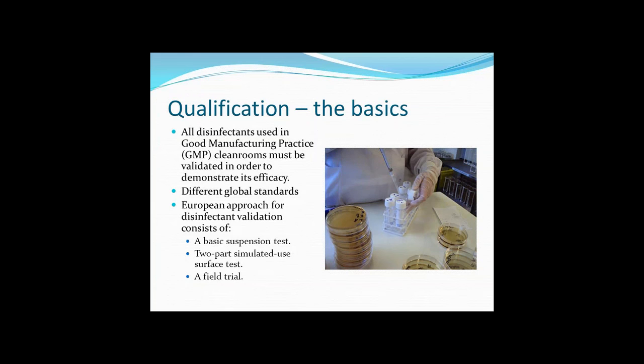So all disinfectants used in good manufacturing practice areas need to be qualified. And here there's a range of different global standards, although perhaps the most logically arranged ones are the European ones. The European approach consists of a basic suspension test, followed by a two-part simulated surface test, which is the greatest challenge, and a field trial.